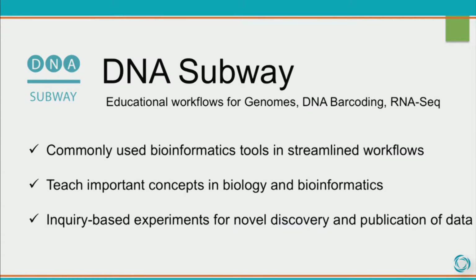Another thing we won't be covering today, but which is also a fantastic tool, is DNA Subway, which is our educational workflow for genomics, DNA barcoding, RNA-seq, and it's really a way to bring bioinformatics into the classroom. We have a number of what I call classroom-friendly bioinformatics workflows, plenty of sample data sets, and also hands-on laboratories and documentation there if you want to use bioinformatics in the classroom.